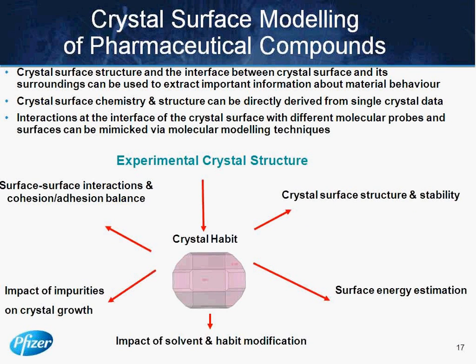The third example, in terms of the application we're going to talk about, is actually starting to move from the crystal out towards broader practical attributes. When you solve the crystal structure, you're able to see the packing of the molecules within the crystal, but of course you're actually able to link that to your external morphology through the Miller indices.